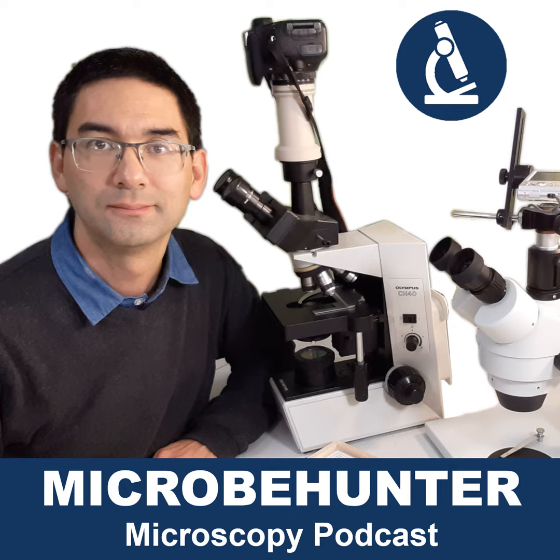It doesn't even have to be a big table. It can be just a relatively small one, as long as it is stable. You don't need much time. If you feel like looking at something, you just turn on the microscope. And you can do this relatively quickly. And you don't have to go anywhere.